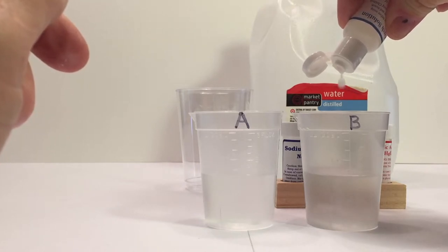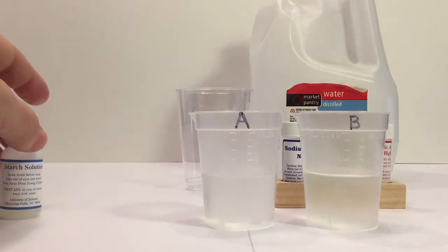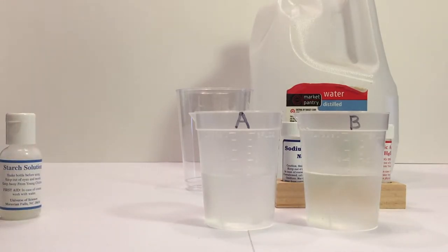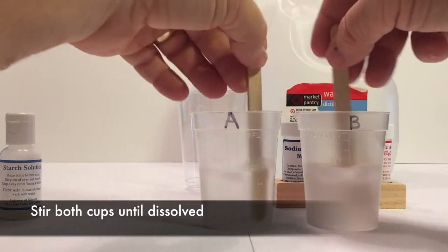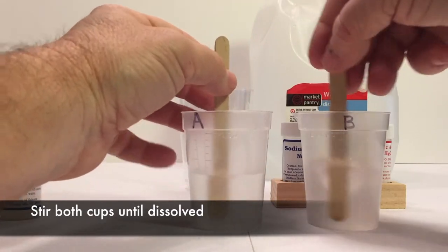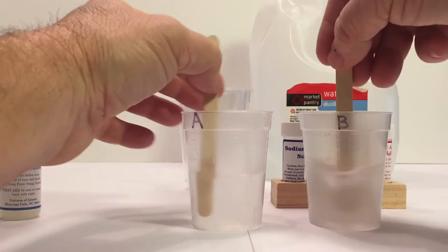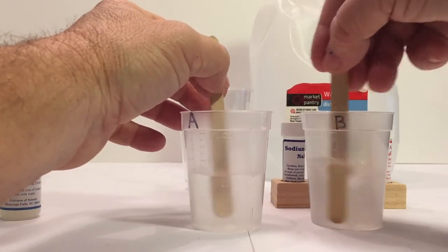And then we are going to stir both cups very well. Now we're going to stir these up with popsicle sticks. You've got to make sure that all the chemicals are completely stirred up. You don't want any of the chemicals still in the bottom. So stir those very well.